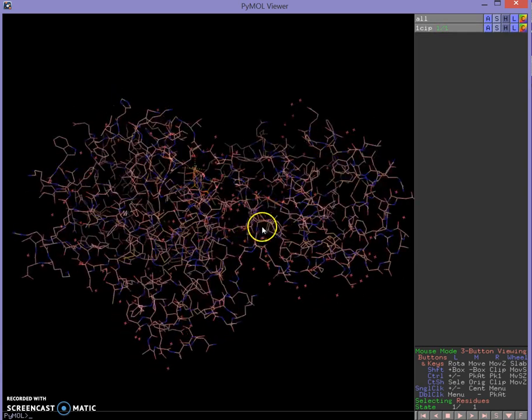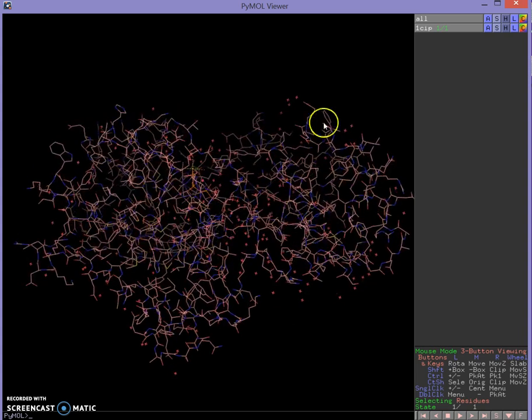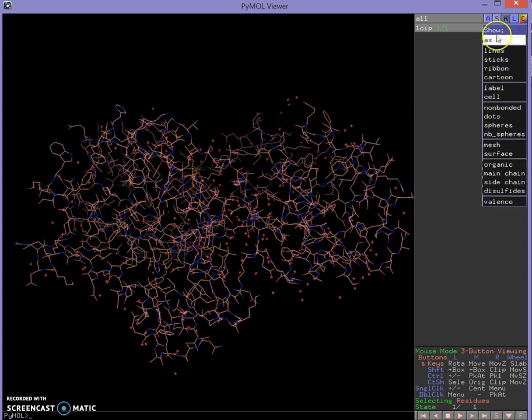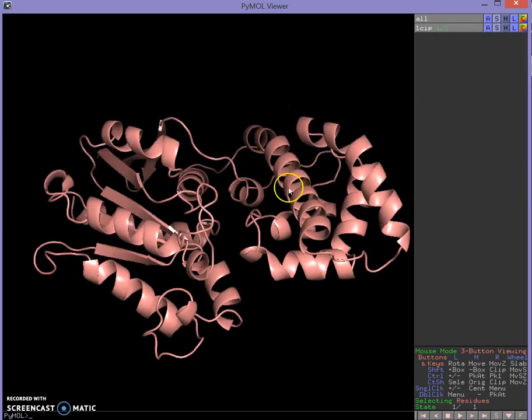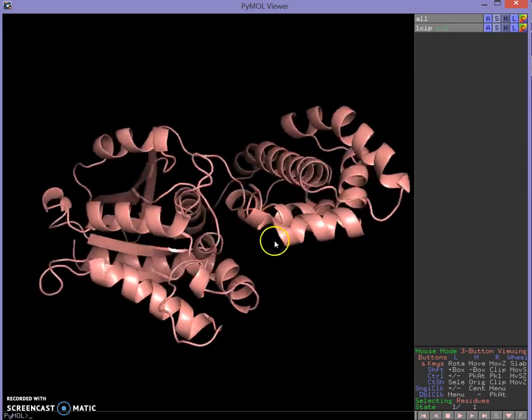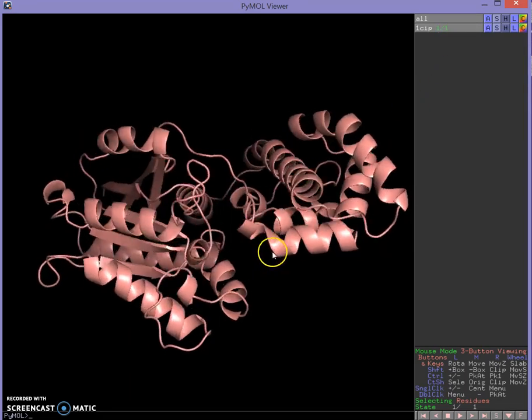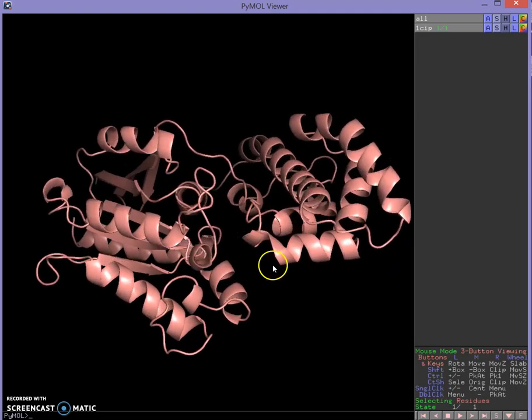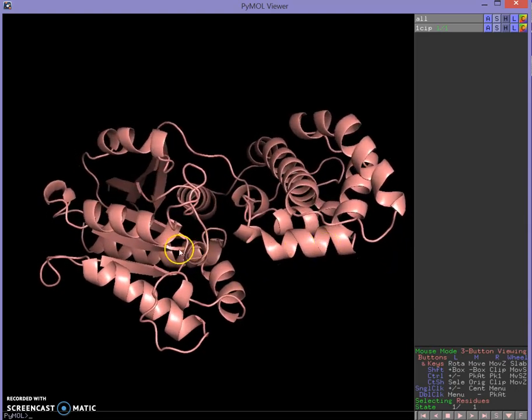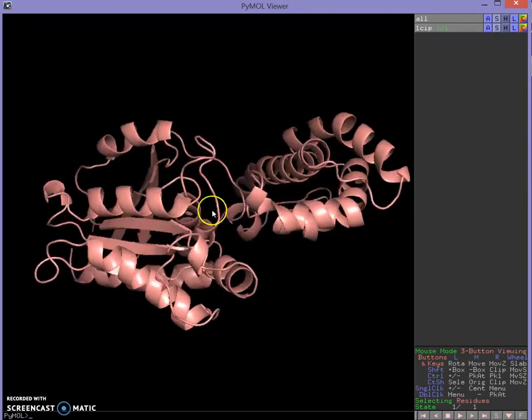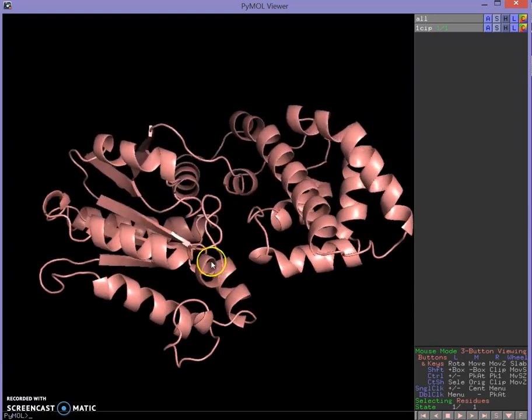It looks kind of like this in sticks form and doesn't look all that pretty, so what we can do is go over here to Show, then Show As Cartoon. Cartoon is going to make it look a lot nicer — we get this nice tan-colored alpha helices, beta sheets, and coils.